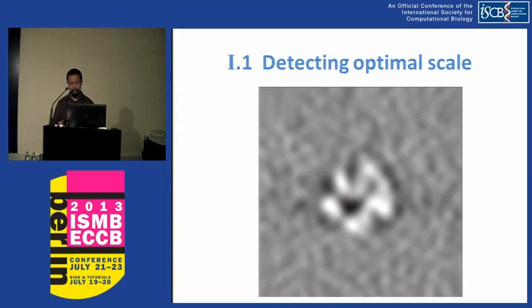And suppose the background intensity of a subtomogram is adjusted to 0, and high image intensity corresponds to high electron density, then we can often observe that our macromolecular complex structures occupy a high image intensity region.